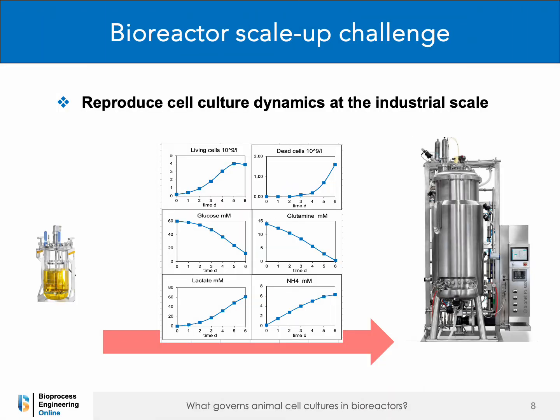When scaling up bioreactor cultures from laboratory to industrial scale, the main challenge is to reproduce laboratory-scale culture dynamics as closely as possible, achieving comparable cell densities and recombinant protein productivities at larger volumes.